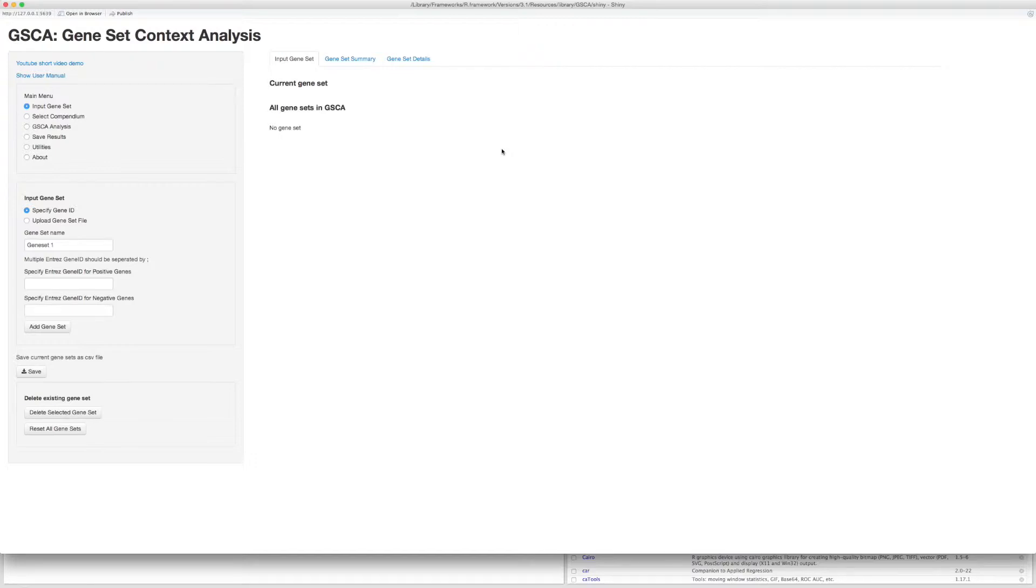The first example is the two-gene set case of human MYC and its target genes. The analysis starts with the input of gene sets. First, we input the gene set of MYC.